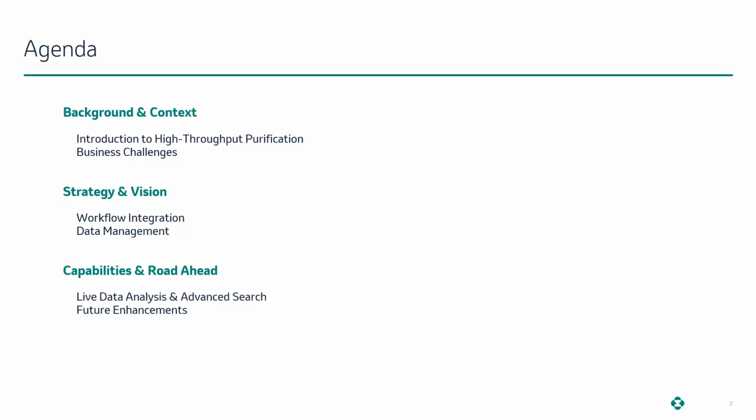So as an outline, I'll take a few slides to explain the background and context for the project. I'll give a brief introduction to the role of a high throughput purification lab in the pharmaceutical industry and give an overview of a typical workflow, as well as business challenges on handling HTP data.